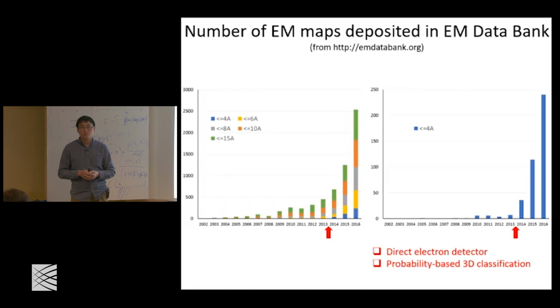You have to worry about the lipids with the imaging, since you are picking one image for one protein at a time. But if the binding of the lipid is not going to dramatically alter the structure, it's probably not an issue. And I'm not aware of one example of that.